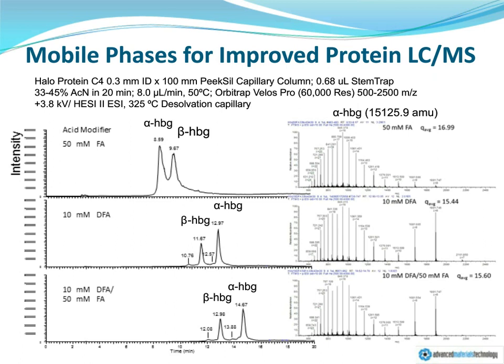By the way, on the left-hand side we have the intensity for the mass spectral detection. And you'll note they're all on the same scale, first of all. So even though there's significant ionization suppression by difluoroacetic acid, there's still enough detection sensitivity, and the marked improvement in peak width is enough to make detection characteristics similar to the intensities that we see with formic acid.